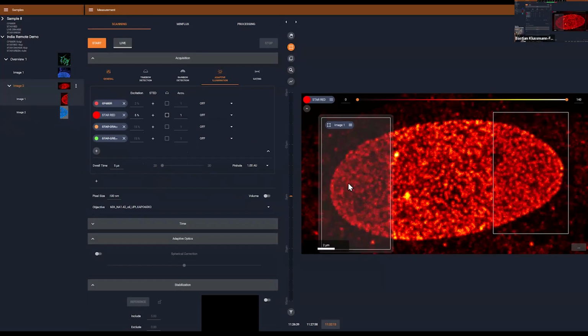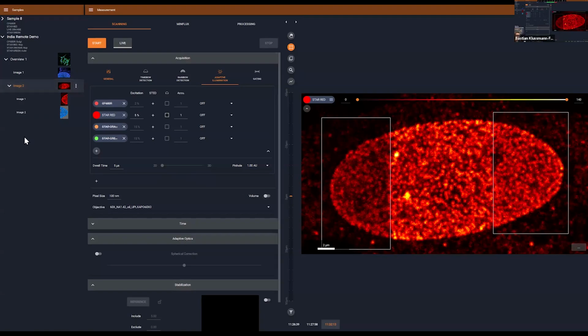So we are going over the sample even slower, right? And by this, you can, as I said, for live cell imaging, dramatically increase the number of frames you are able to image. Or, as I said, if you have more complex 3D volumes, this is also quite helpful to not pre-bleach structures that are above and below the focal plane. Okay. Any questions so far?